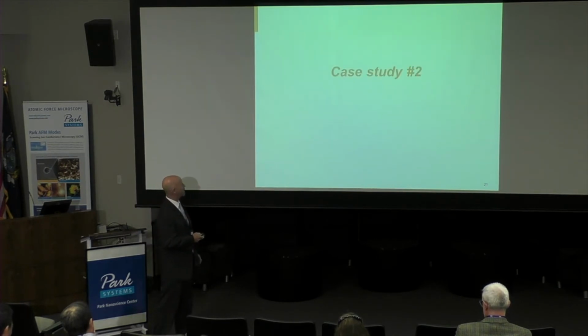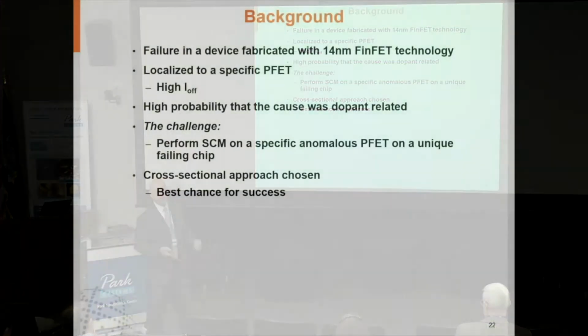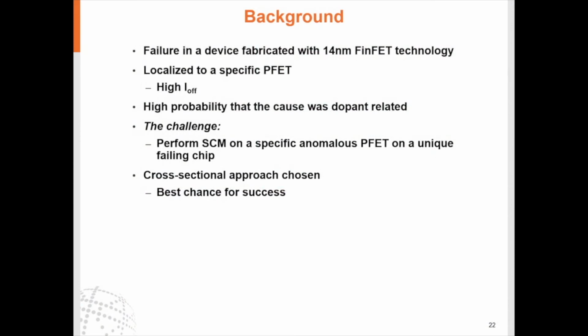Now, let's look at another case study. This is in a 3-dimensional device fabricated in 14-nanometer FinFET technology, state-of-the-art production. And in this particular analysis, we're looking at the same problem, off current. I mean, the device is turned off, but it's still leaking current.